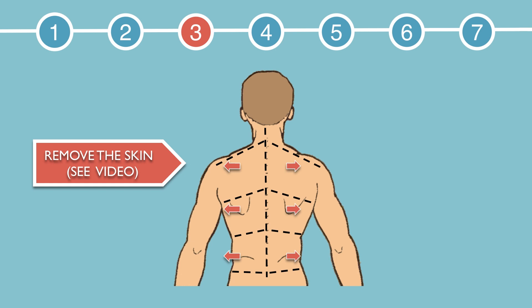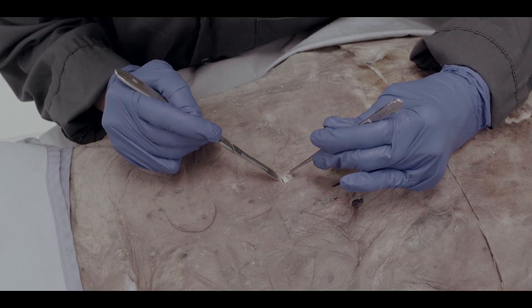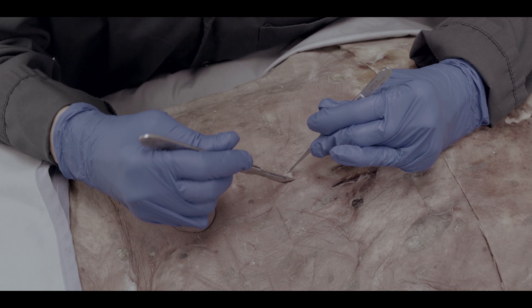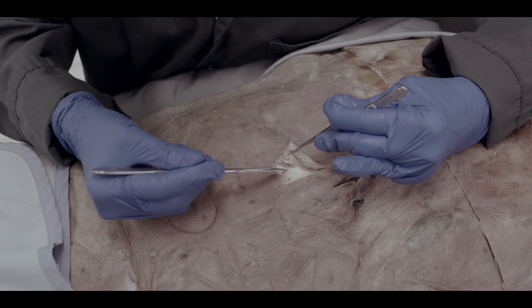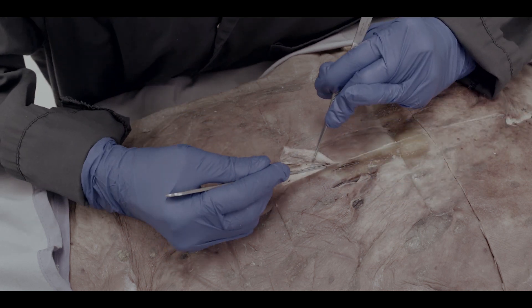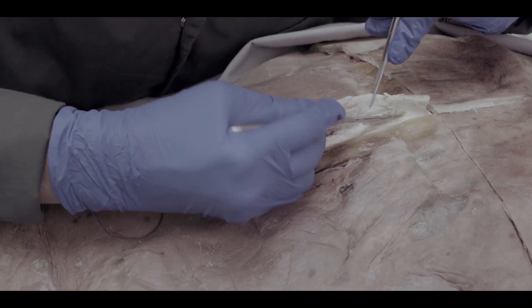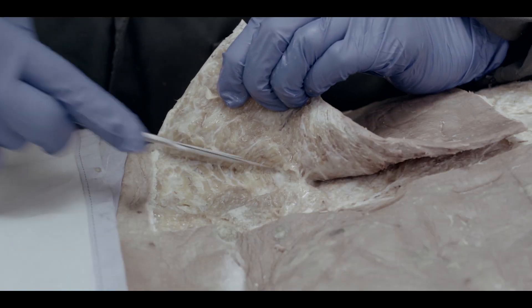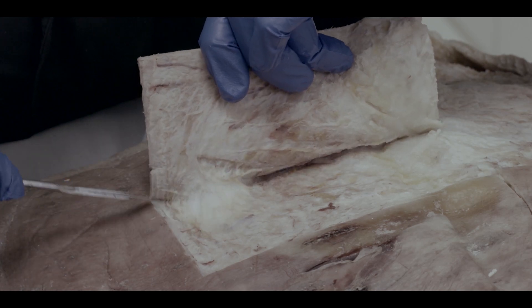There's a video up next that will demonstrate this step. Using the tooth forceps, grab the corner of the skin for one of the flaps you've created and pull it towards you to create tension. Then, using the scalpel, separate the skin from the underlying fascia. Angle the scalpel blade so it is almost parallel to the cadaver, rather than pointing it into the cadaver. It's worth noting that the thickness of the fascia and adipose vary depending on the part of the body you are working on, so there will be more adipose near the occipital bone and iliac crest, and less in the center.